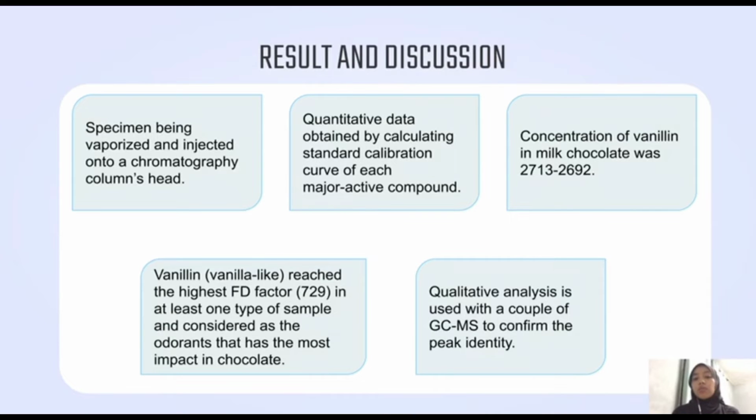Last but not least is qualitative analysis, which is used with a couple of gas chromatography mass spectrometry to confirm the peak identity.